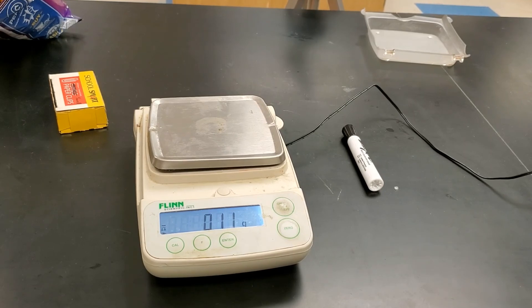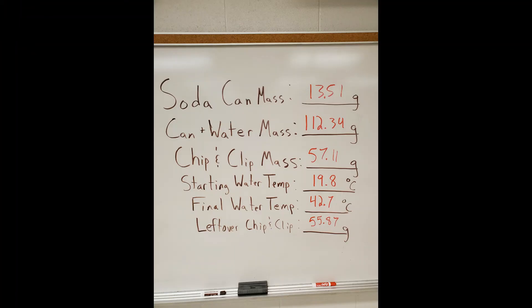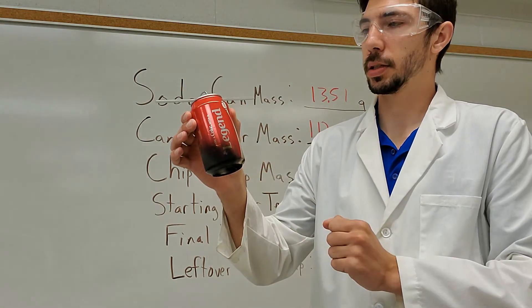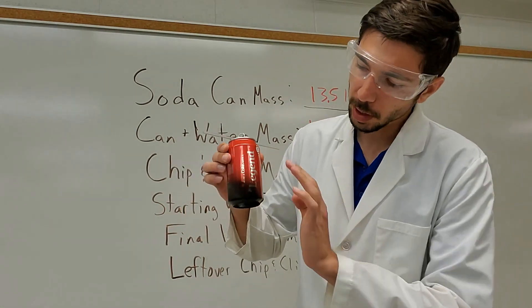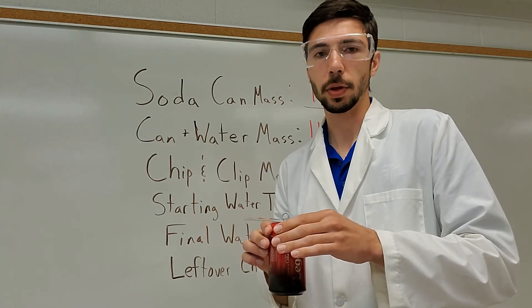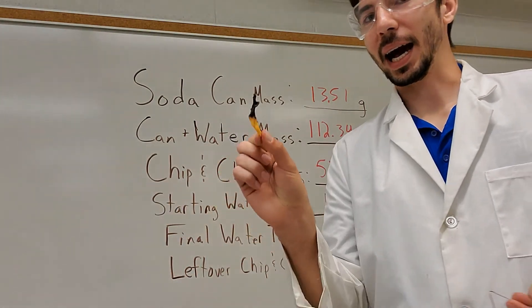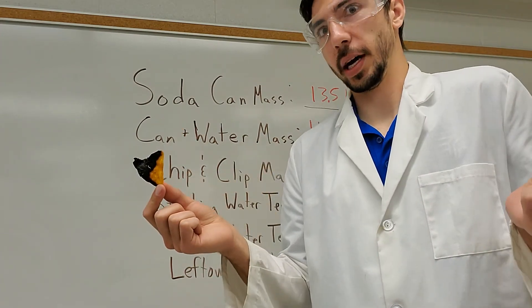All that's left now is to mass the leftover stuff. One thing you may notice is the can has a little layer of soot — that's essentially just carbon leftover from the combustion. If you were to do two trials as the paper says, make sure you clean off the soot and re-mass everything, taking initial temperatures and masses all over again. The leftover water has just been heated up so it can go down the drain. Your leftover chip — I don't recommend eating it, it would taste like what's left in a campfire — otherwise it just goes in the trash.